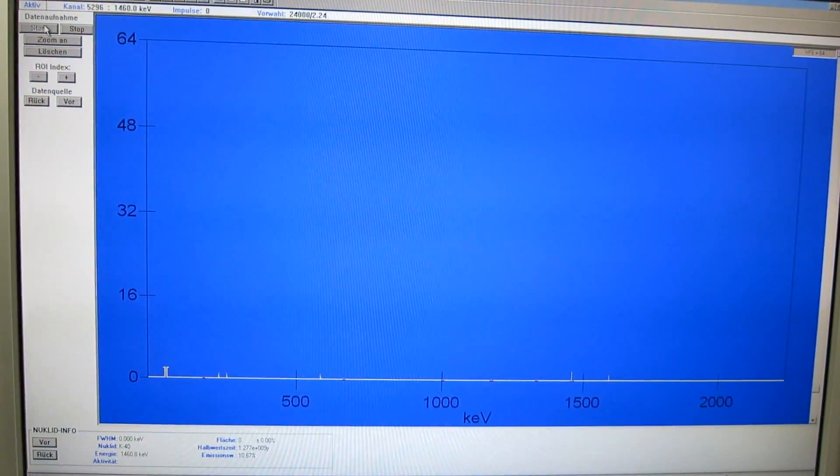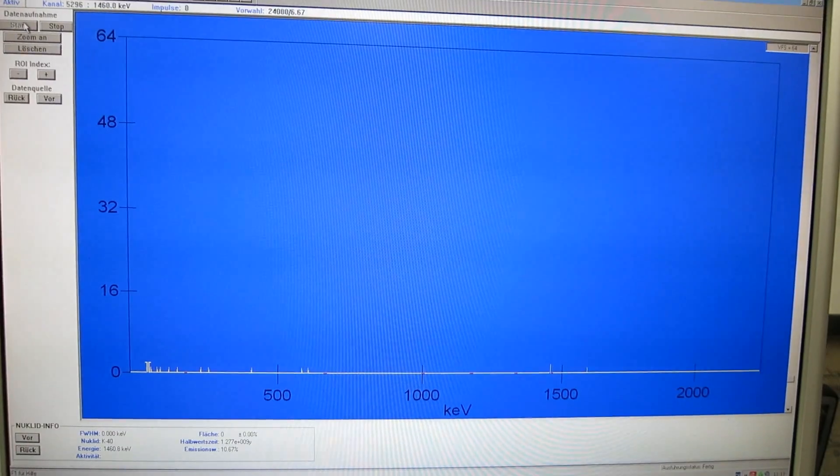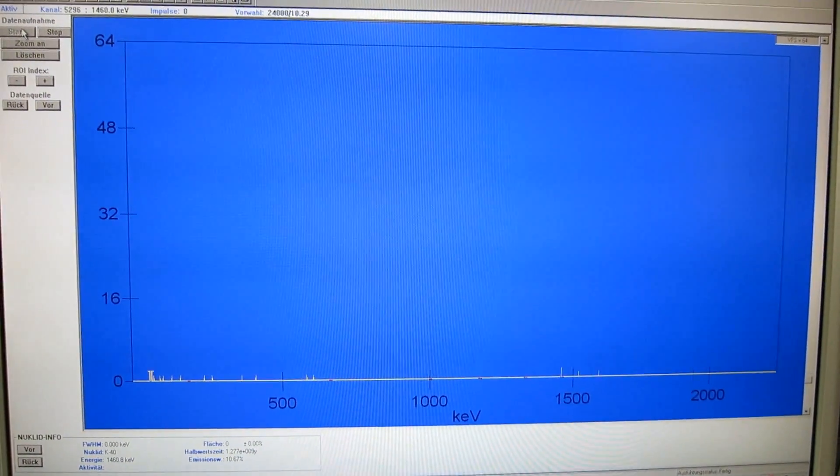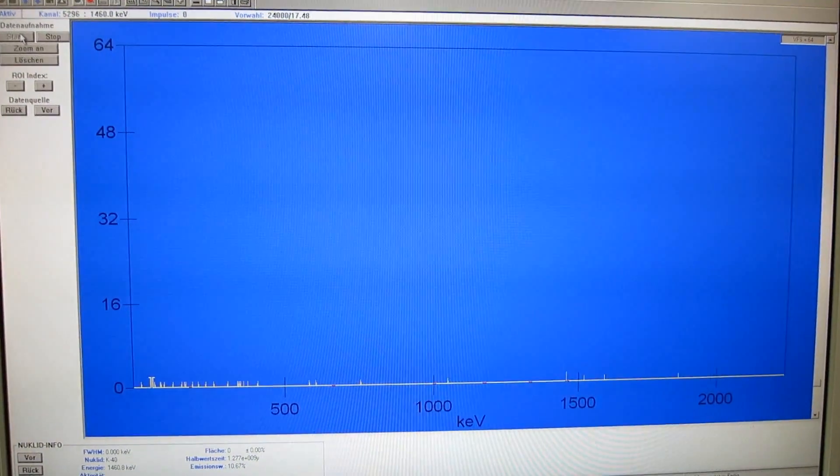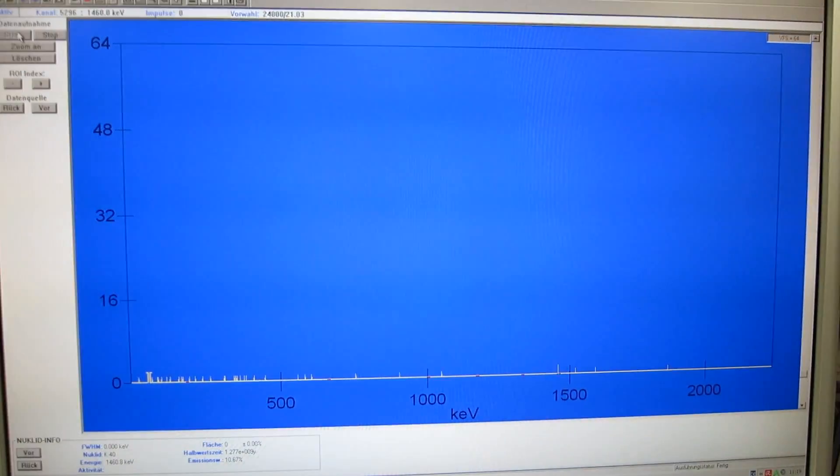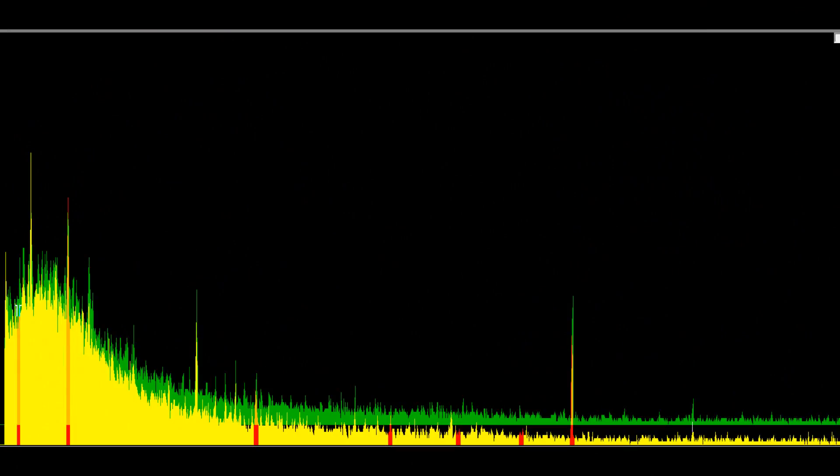So it's time to chuck these balloons into the germanium detector and see what the gamma spectrum says about that. Well, not much, but let's give it some time.